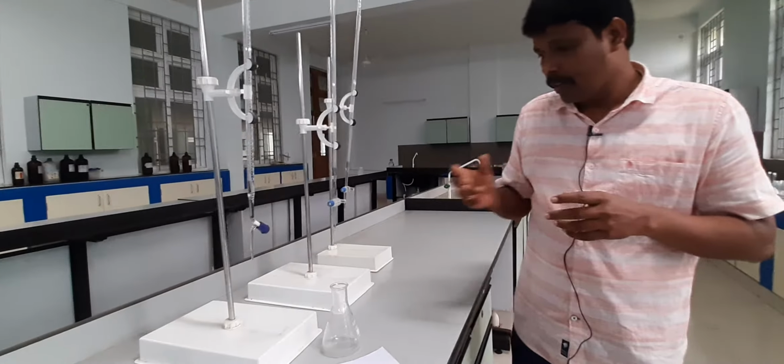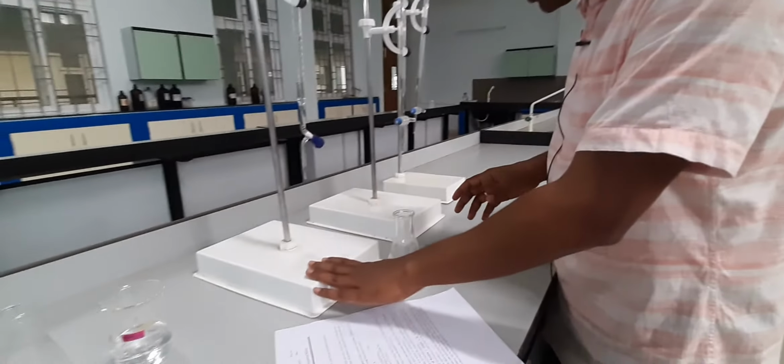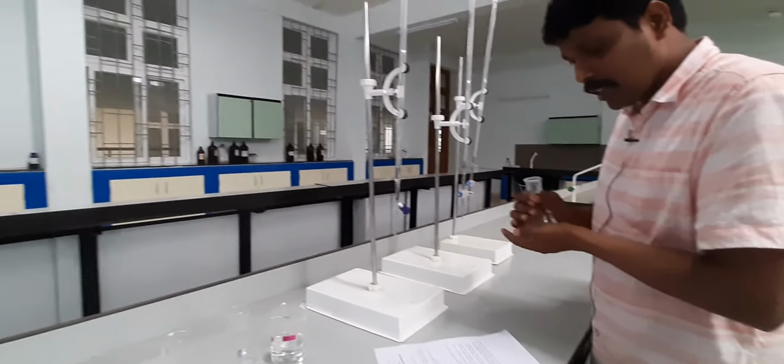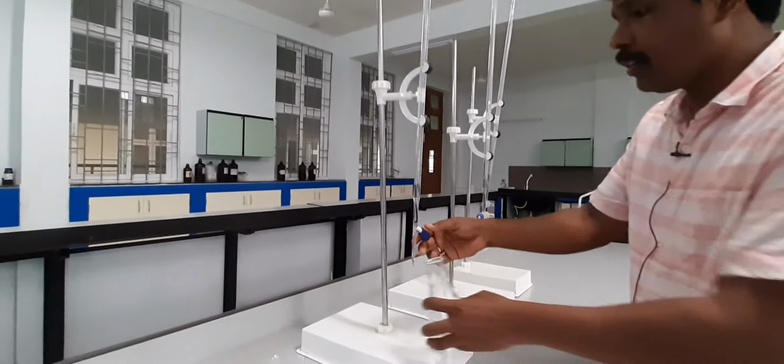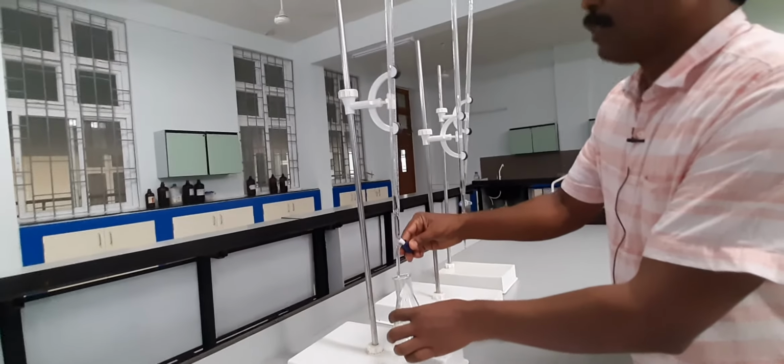And let's say, for the sake of convenience, I have here acetic acid. I will take 10 ml of acetic acid initially. This is a 25 ml burette.